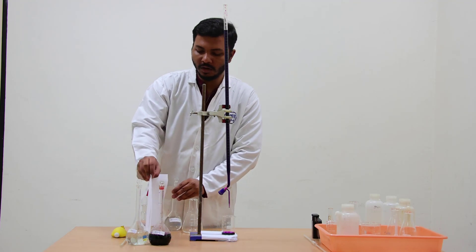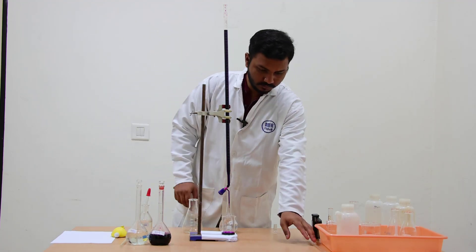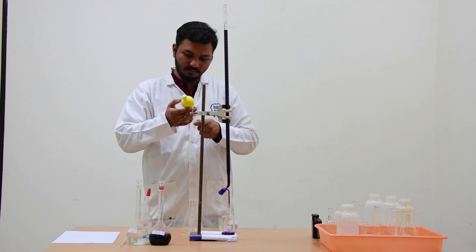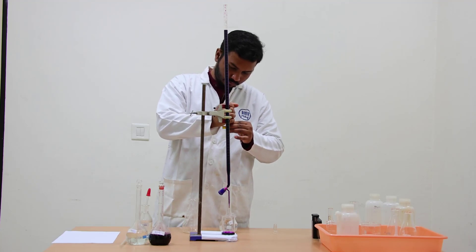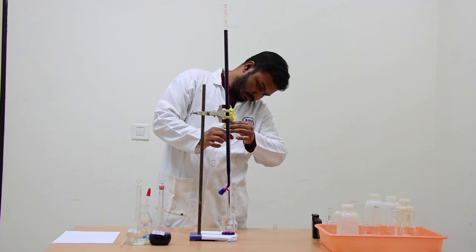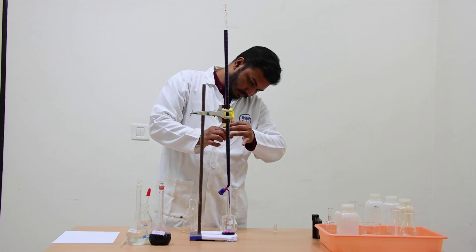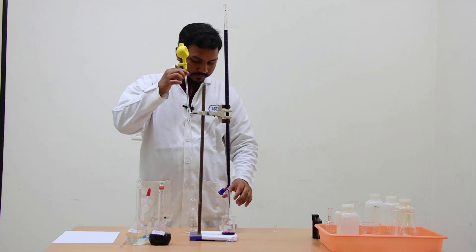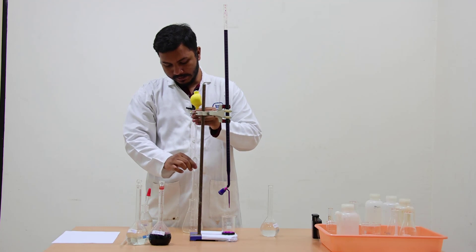Now we have to add 4 normal H2SO4. Here also we take the lower meniscus of this liquid and add it into the Mohr's salt solution.